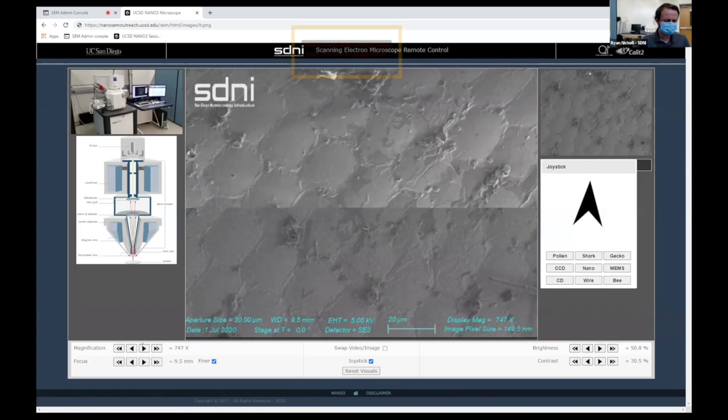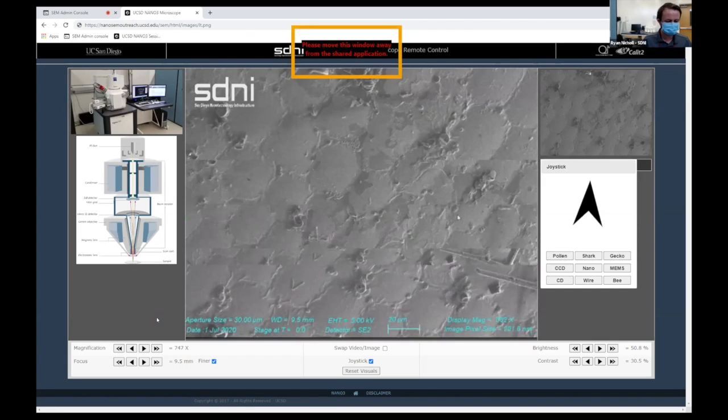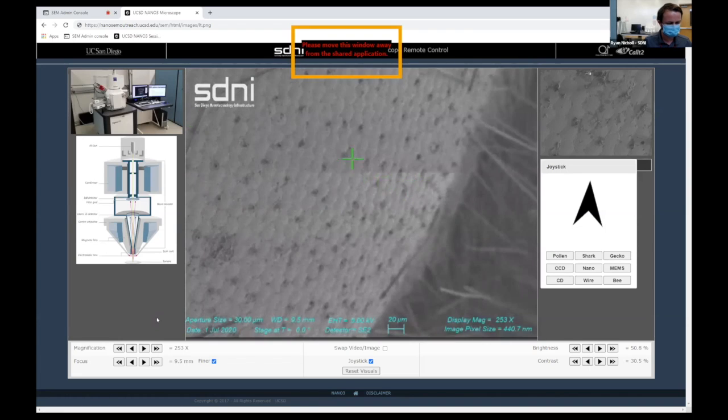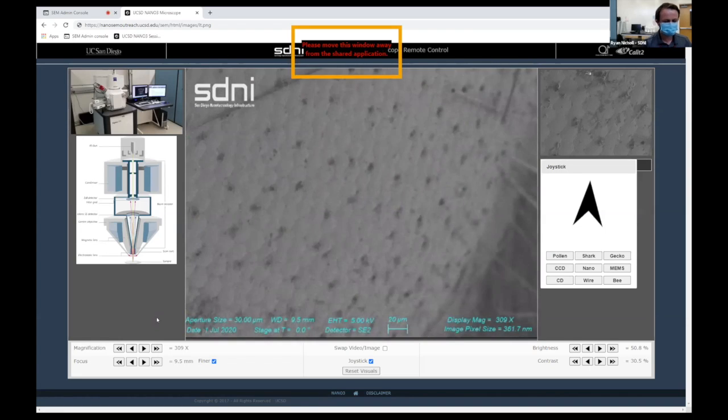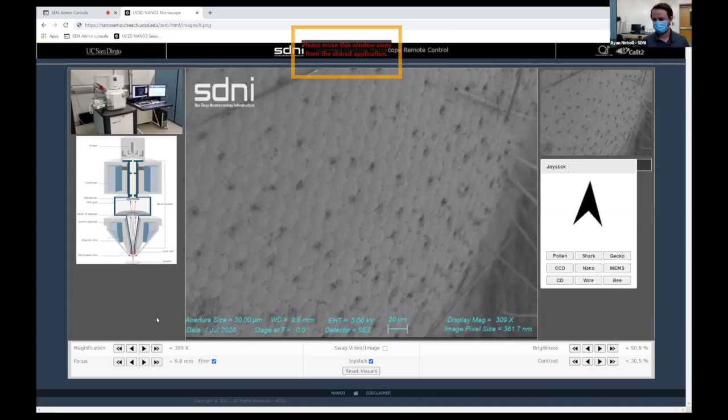There's probably a cleaner location. Unfortunately, this is a sample that's been used over and over again. But we're looking at, what's this, 20 microns, maybe a fifth of the size of a human hair. Maybe if I go over here, you'll get a better perspective. Ah, here, perfect. I don't want to steal your thunder. I really want you to play around, get a feel for how it all works. But you can certainly now start to see that hexagonal structure a little bit better.